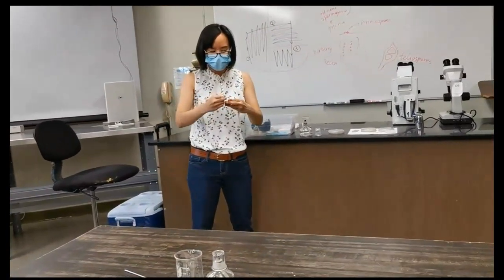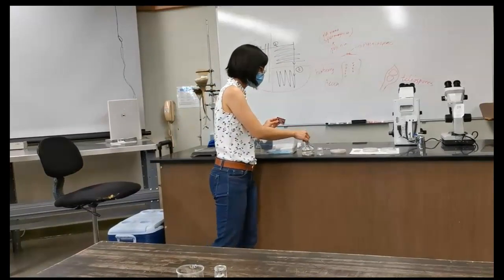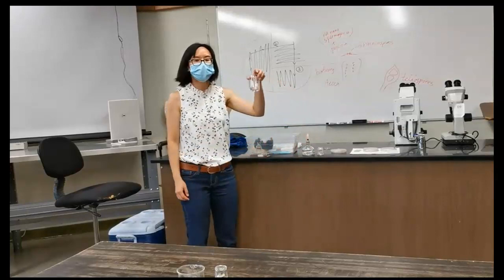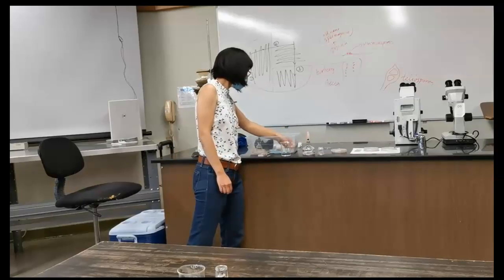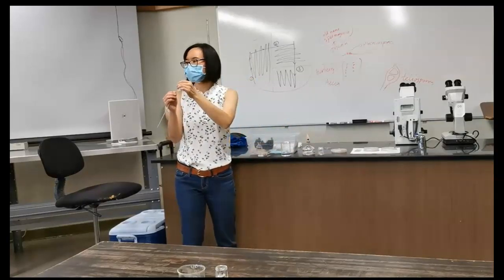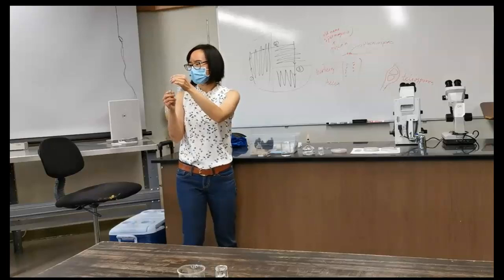You need ethanol burner if you want to make sure everything is clean. And you also have a beaker with ethanol in it, and then your inoculation loop, which is here. Before you burn the inoculation loop, make sure they're straight.